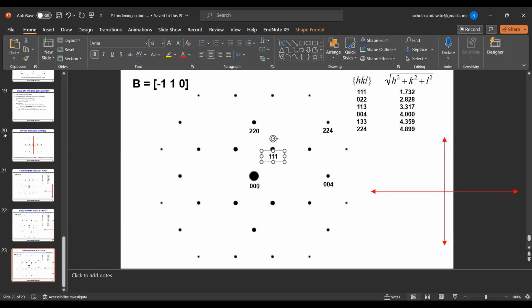So then if we add, okay, if we add half of this G vector to this, we get this. Okay, so half of this is 0, 0, 2 plus 1, 1, 1 is 1, 1, 3. Okay, right? And then from here, pretty straightforward. That's, of course, all the opposite indices.